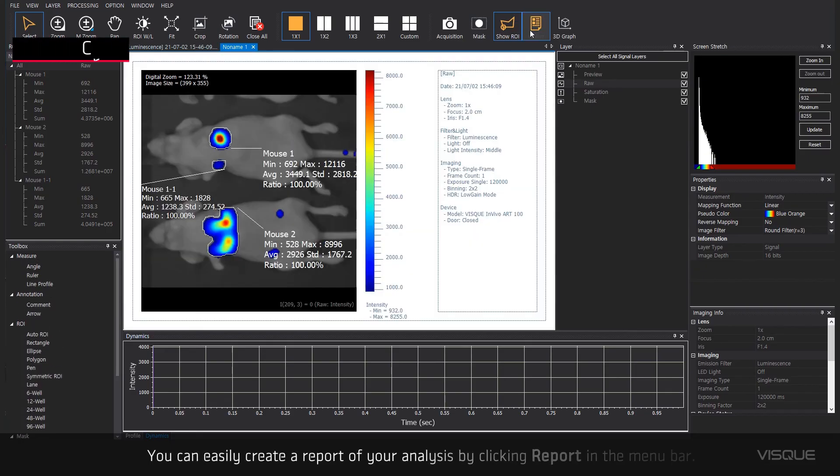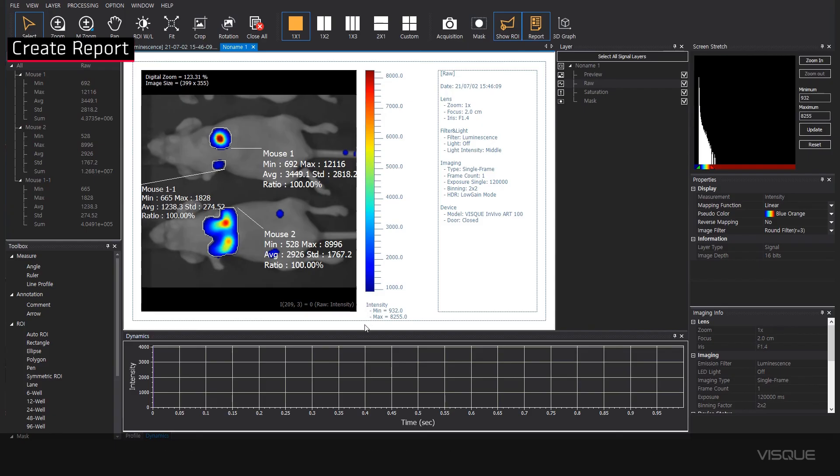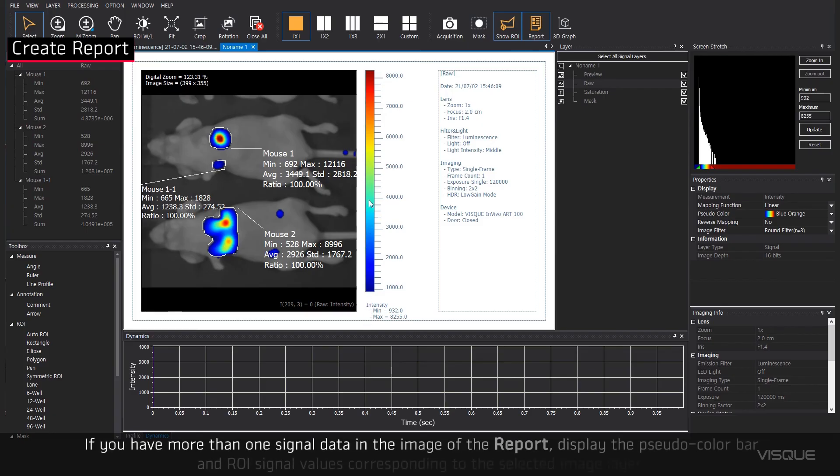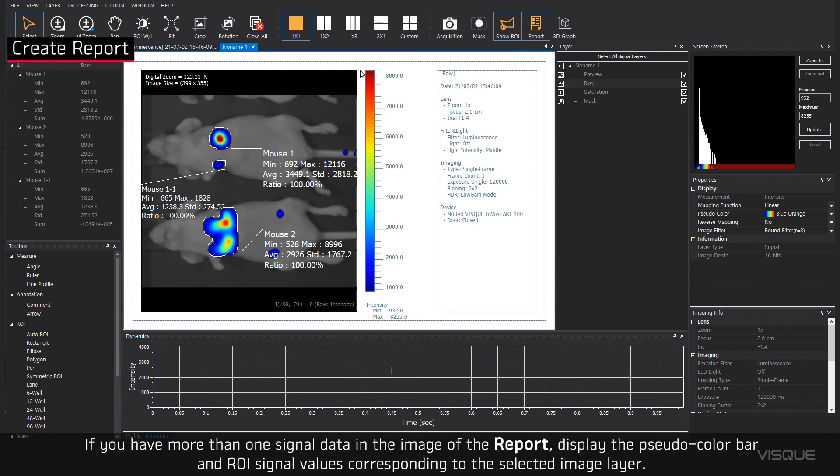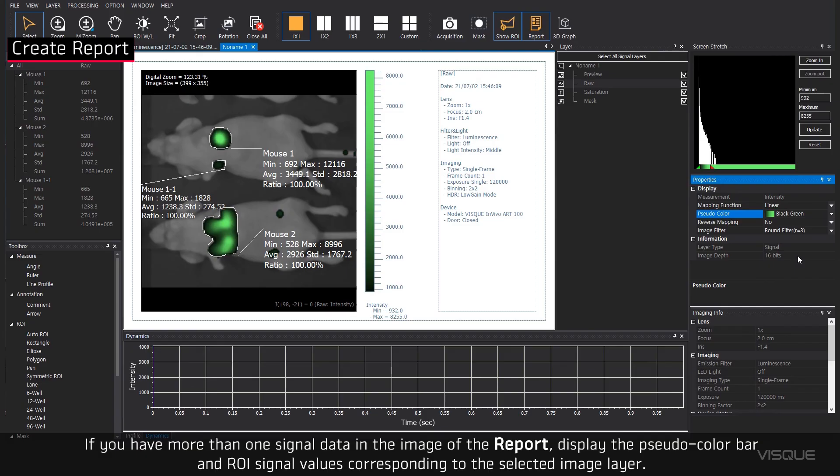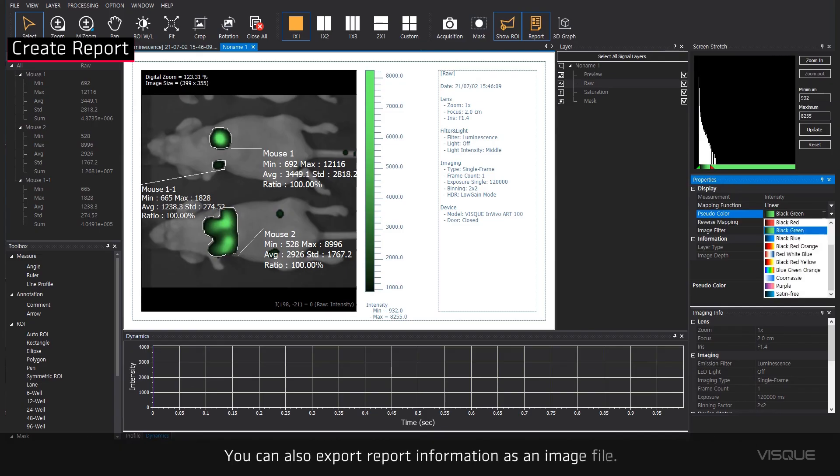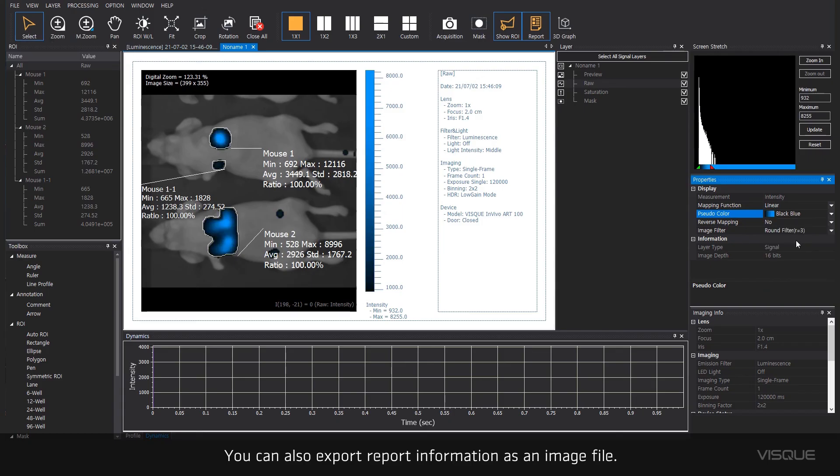You can easily create a report of your analysis by clicking Report in the menu bar. If you have more than one signal data in the image of the report, display the pseudocolor bar and ROI signal values corresponding to the selected image layer. You can also export report information as an image file.